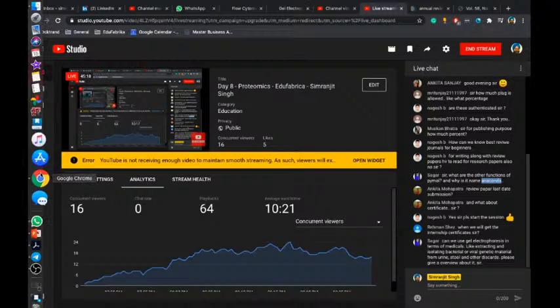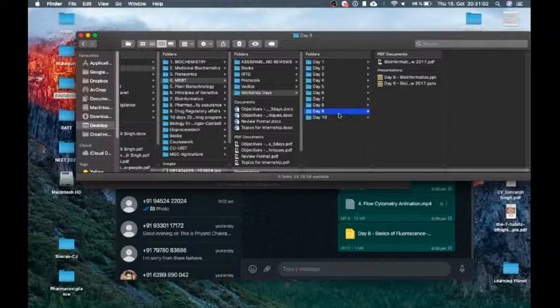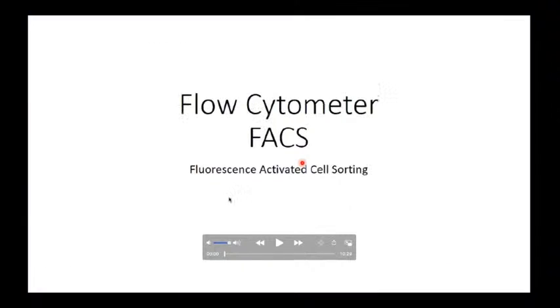So now I take you to some videos. Sit down, enjoy some videos now. They will explain forward scatter and side scatter, how you make a 2D histogram, and how to analyze your data from the blood samples. That's the main idea behind this. So I will start.